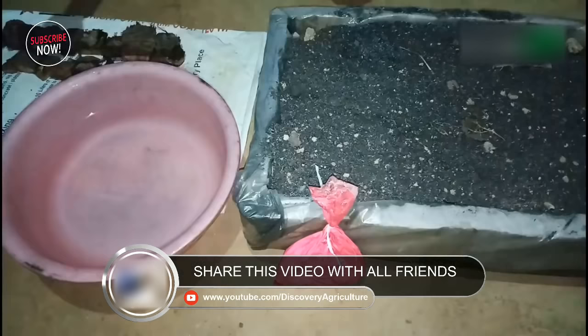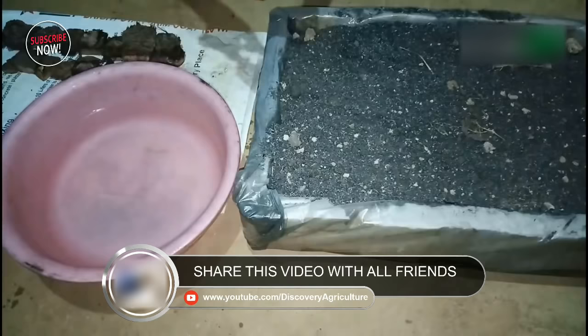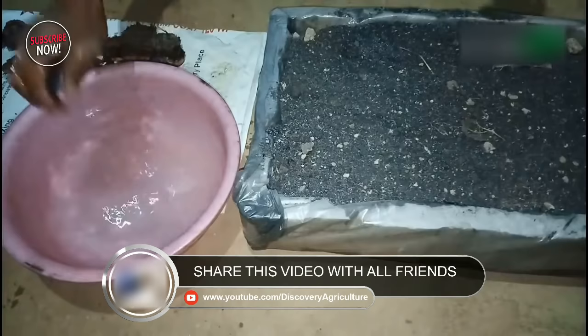Next, we have to prepare the buds. At first, we have to sterilize the buds. Here, we use washing detergent for sterilization purpose. Mix detergent with water and wash all the buds in that solution.